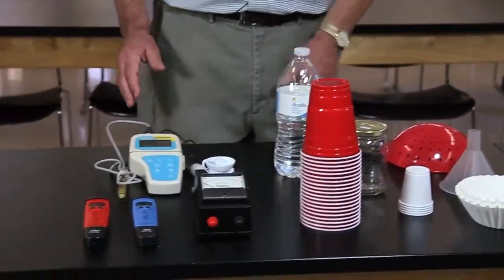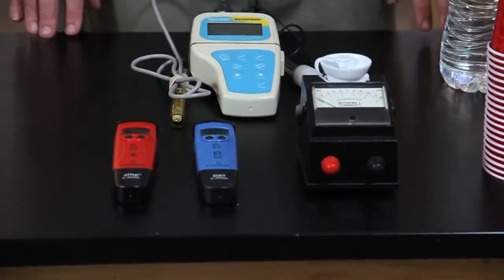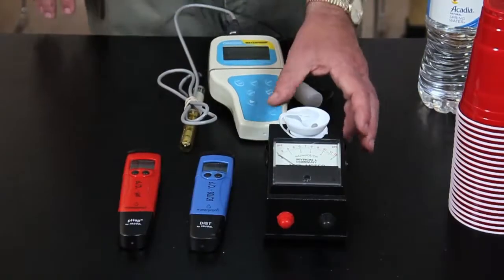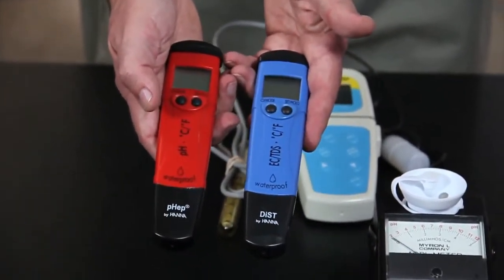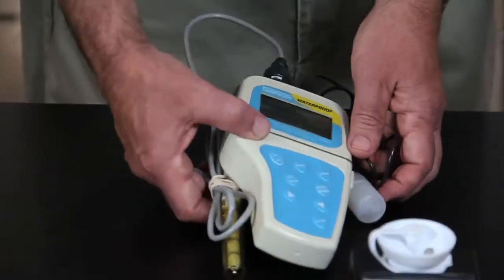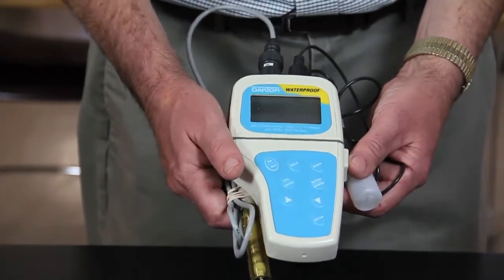Additionally, you will need some pH or EC meters in order to analyze your soil when the test is complete. Some people have an Agra meter already at their greenhouses. Some might have pH and EC pens for pH and soluble salts. If you thought you would do a lot of testing, maybe you would go with a laboratory grade meter.